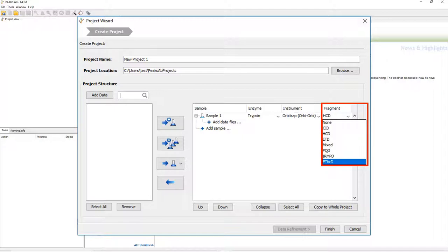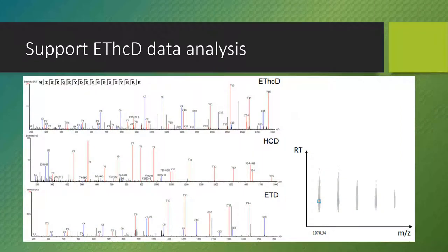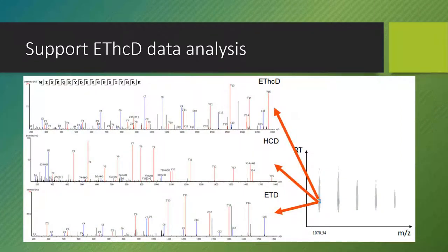ETHCD is a recently developed fragmentation method. Electron transfer dissociation is first applied, followed by HCD fragmentation. Therefore, an ETHCD spectrum looks similar to the union of an ETD and an HCD spectrum, containing both BY and CZ ions.